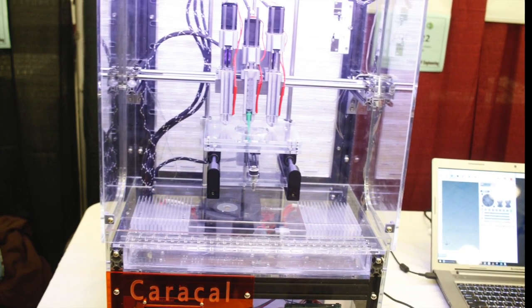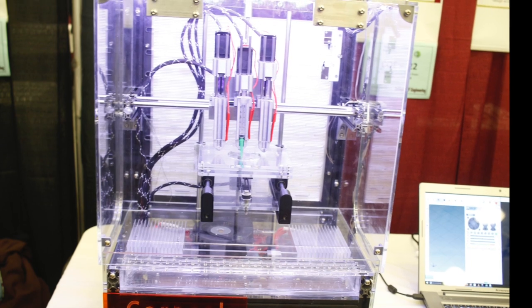Hi, my name is Cameron Hume. I'm part of the 3D biomedical project called Caracol. One of the problems we've experienced with bioprinting is that all bioprinting nowadays needs to be done inside a laminar flow cabinet.